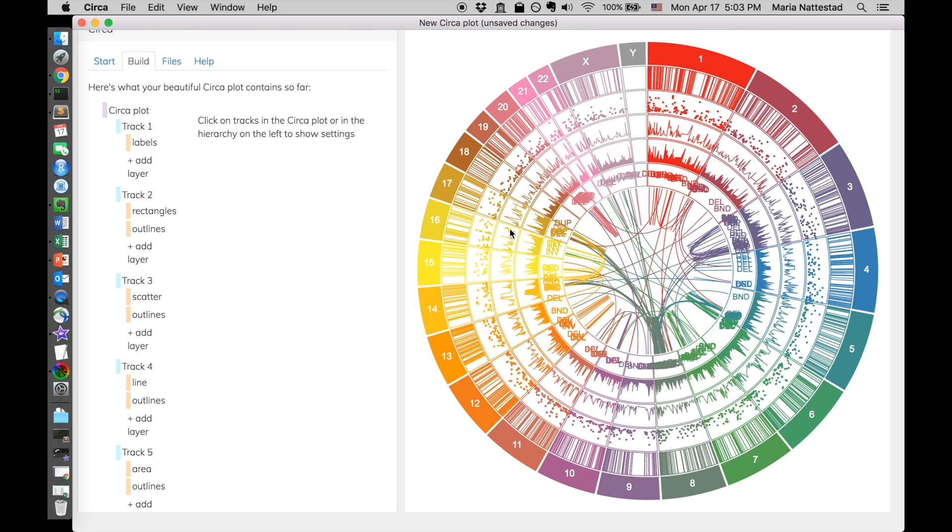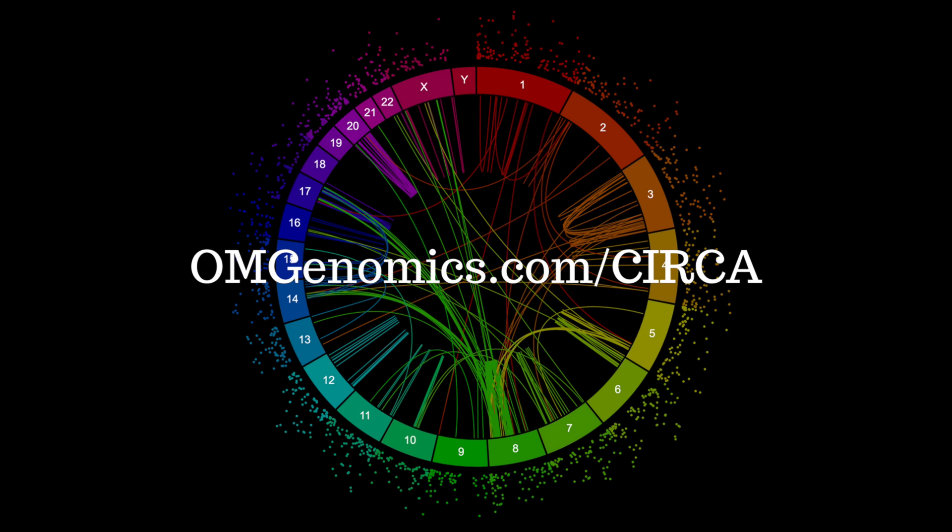And so here we have a very complicated, but very nice looking Circos plot, made using Circa, and this shows you one of each type of layer. So that's it for this tutorial. Check out Circa at omgenomics.com slash Circa.